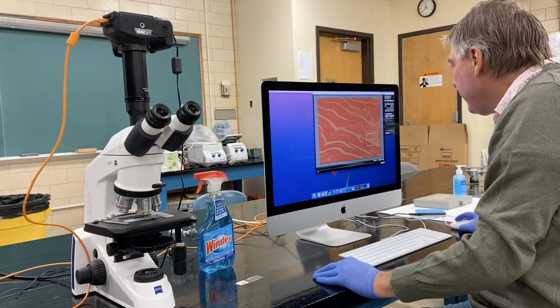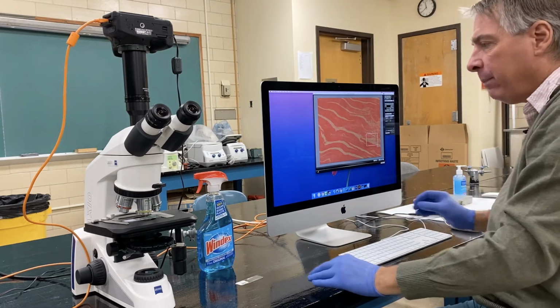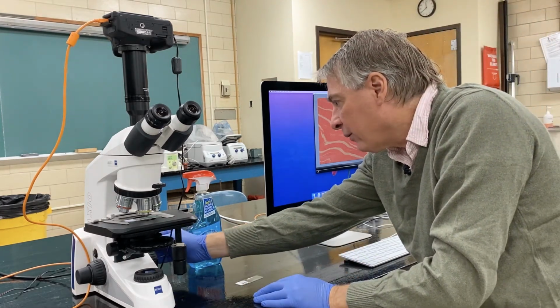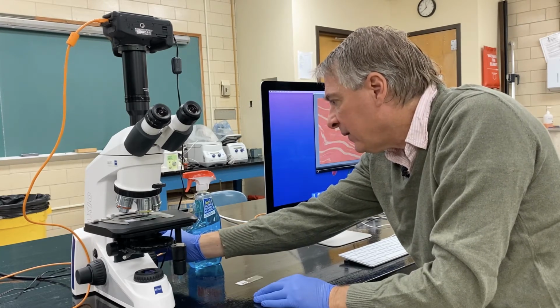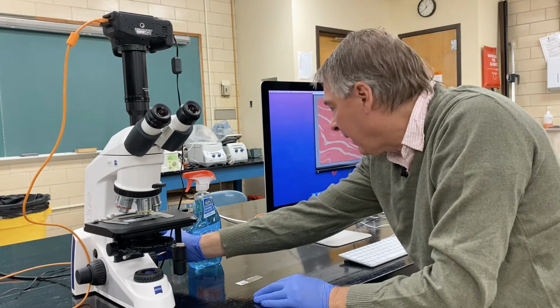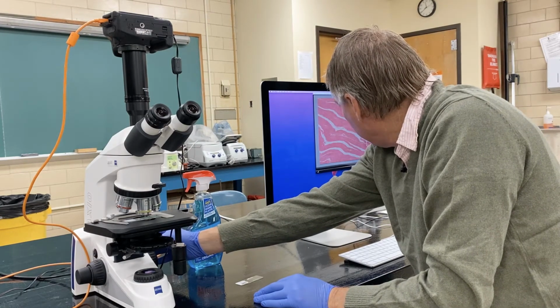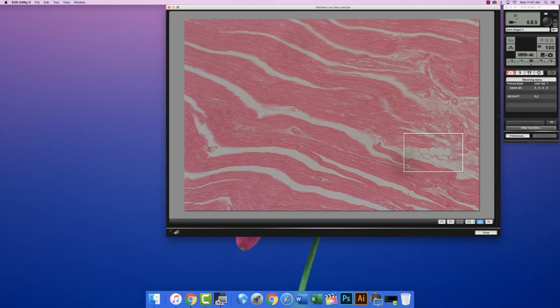So I'm going to increase the amount of light by increasing the power on the light bulb, which again is on the back right side of the microscope, and there are 3 finger wells to help you turn it, and I'm turning it clockwise, which is adding power to the light bulb. I'm going to mouse over, and my shutter speed is 1/60. That's a little better, but I'm going to keep going.